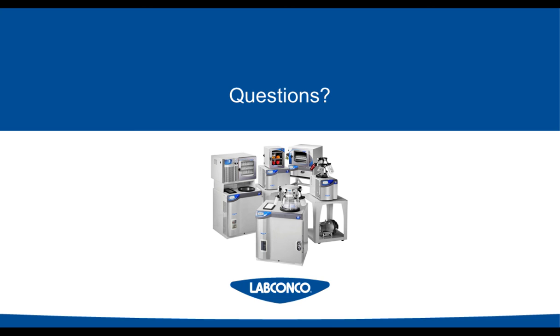Well, the best one really is dependent on the solvents that you're going to be using. So before you buy a freeze dryer, what we always recommend is knowing who's going to be using it, what solvents, or is it just aqueous that will be run on the unit. And then you also need to know how many liters of moisture you want to remove at a time. So before you decide on what you want, make sure you have those questions answered. Labconco actually has a questionnaire that can walk you through each and every item that we need to know about. And so we can send that to you prior to making a recommendation.